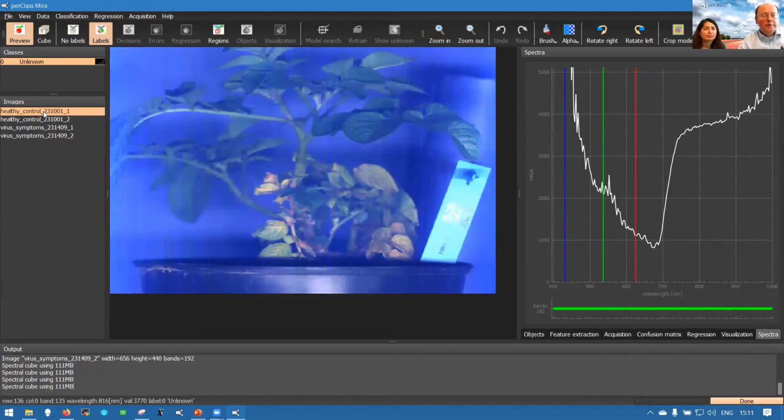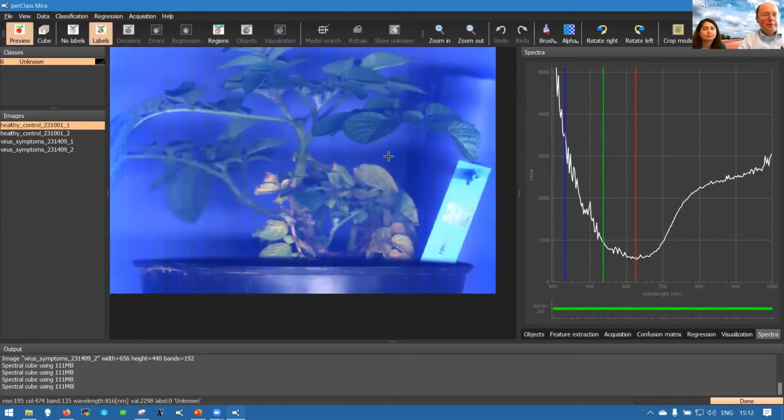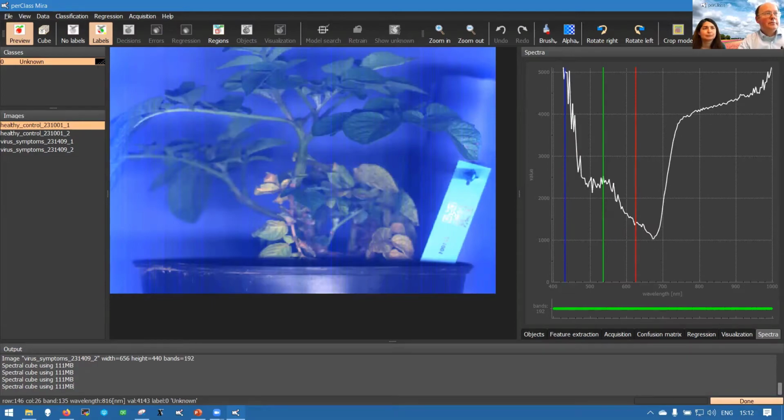What we would like to do in this tutorial is first of all learn how to build a classification solution on the pixel level, and then we will look at the visualization and interactive construction of spectral indices, and then we actually use both of these topics or technologies together. So in projects, let's say phenotyping projects, the first task will be segmentation of a plant from background.